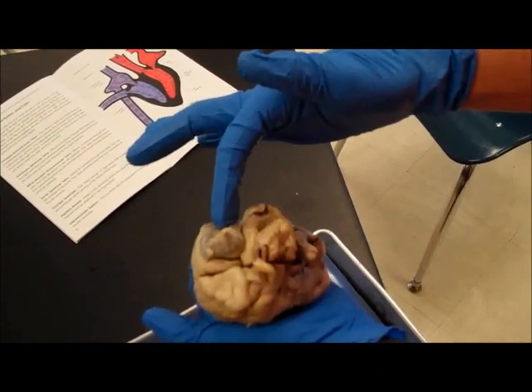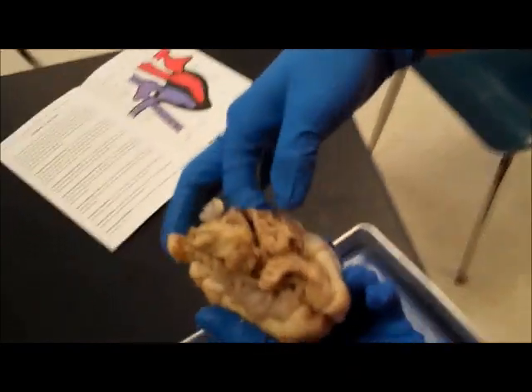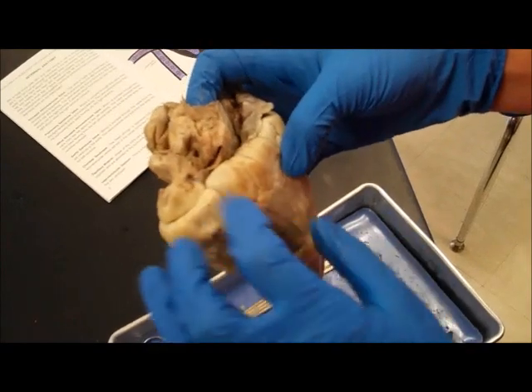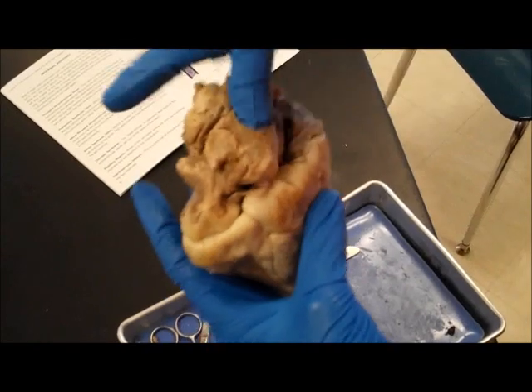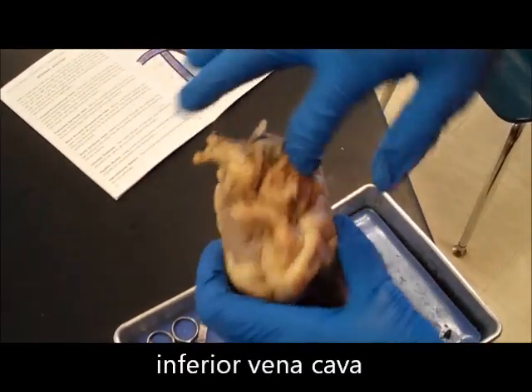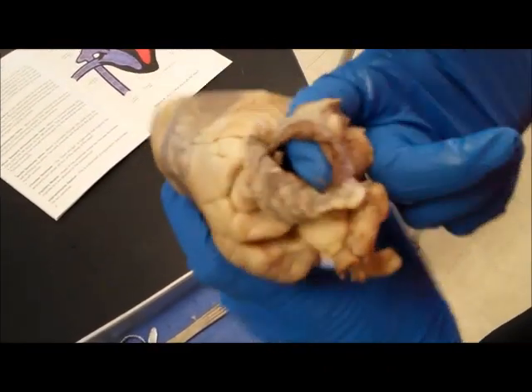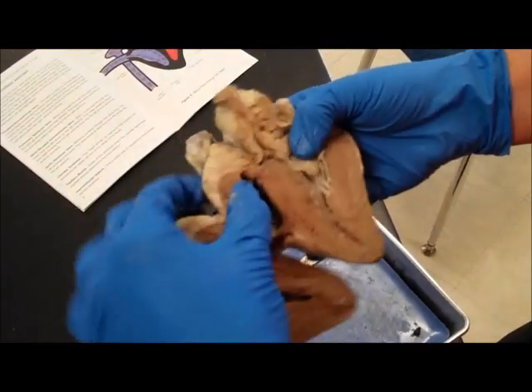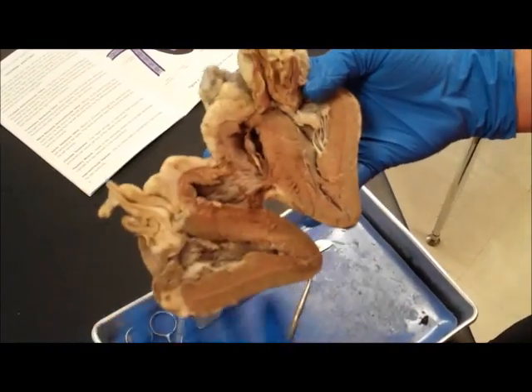So I'm locating my right atrium up here. Now I've flipped back to the dorsal side of the heart. You can see that there are two openings right here where I can put my finger through. Up top is the superior, down low is the inferior. And both of these are going to flow into this atrium, and notice it is cut open so I can see where that is. If we look inside, we don't have that view because we didn't cut through it. It might look different on your heart.